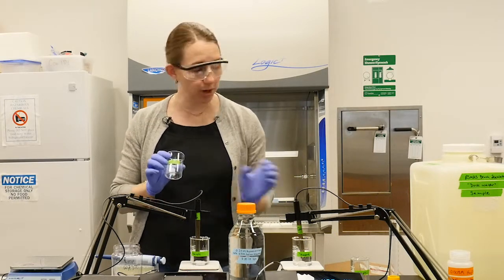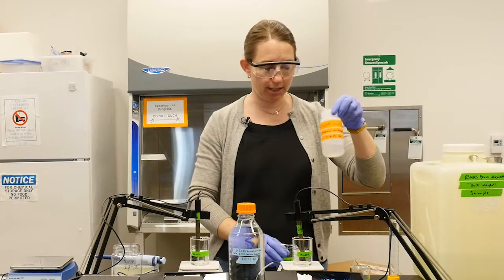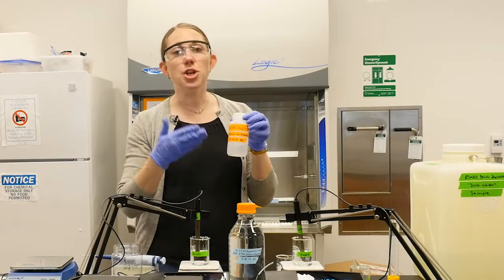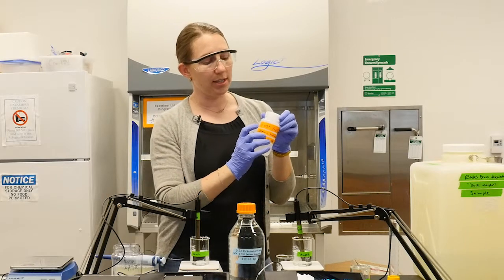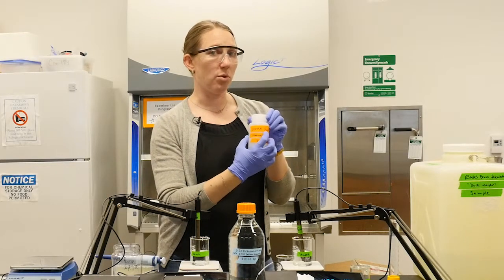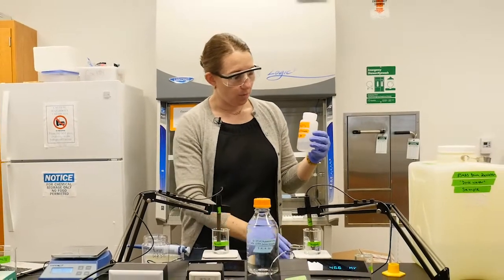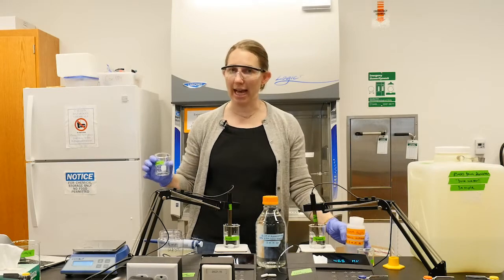So we're going to start with our standard, and what we use for the standard in this experiment is sodium carbonate. So this has a known amount of those dissolved carbon species that we described. We are working with 0.003 molar carbonate. So we're going to measure 50 milliliters in a graduated cylinder, but we're going to weigh exactly how much that is.